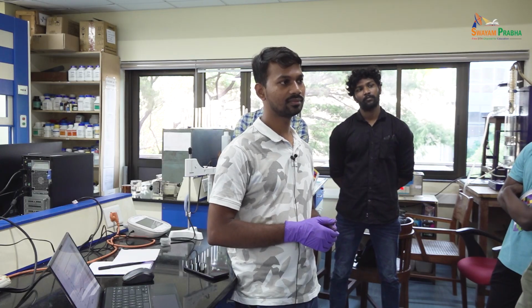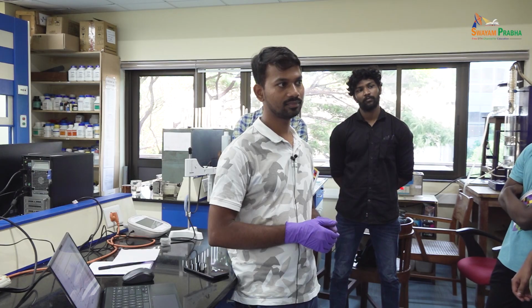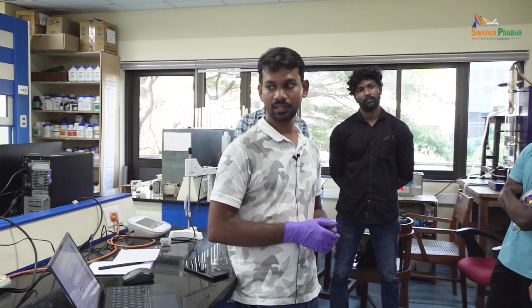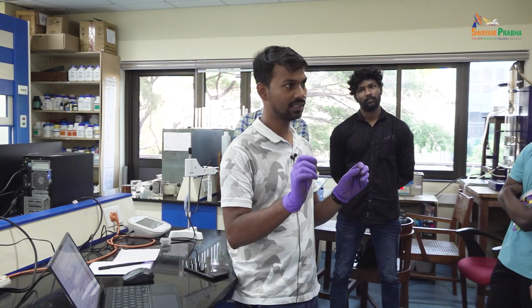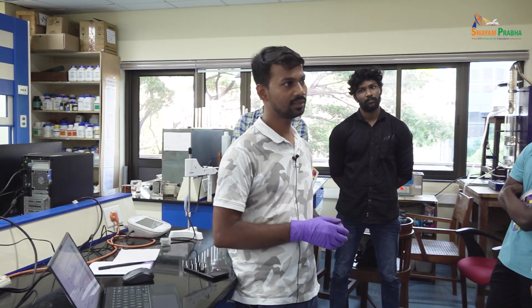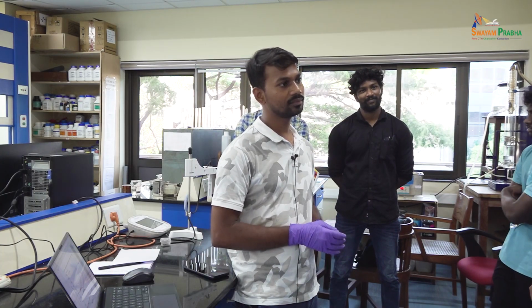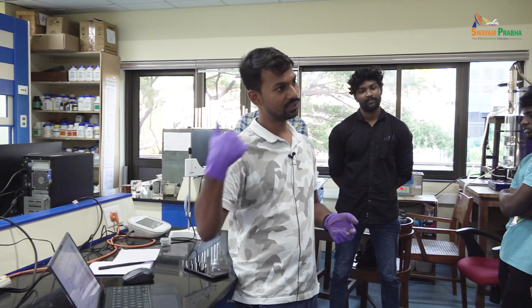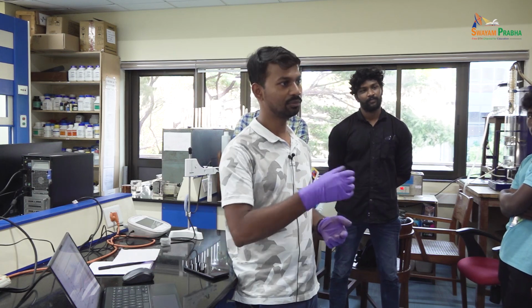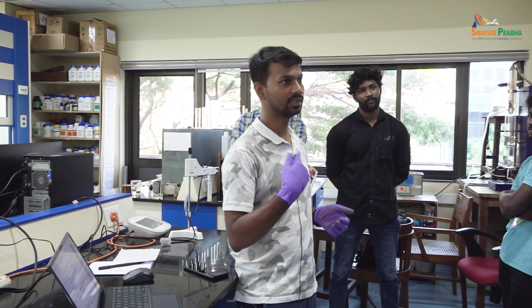I will just dismantle it, remove the KCl solution, fill it again and calibrate. I calibrate with respect to another reference electrode. If I am using another Ag/AgCl, the difference should be almost near 0.